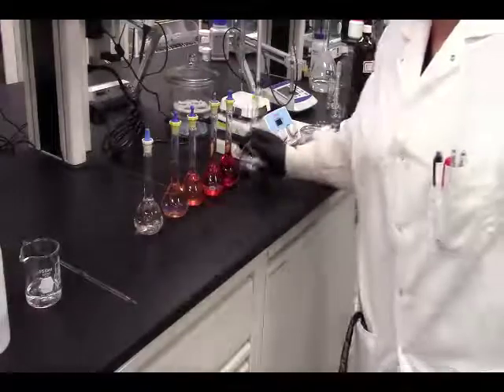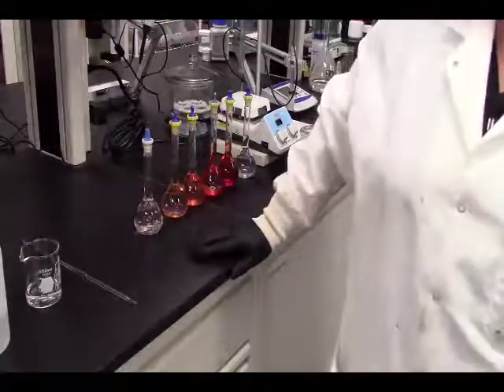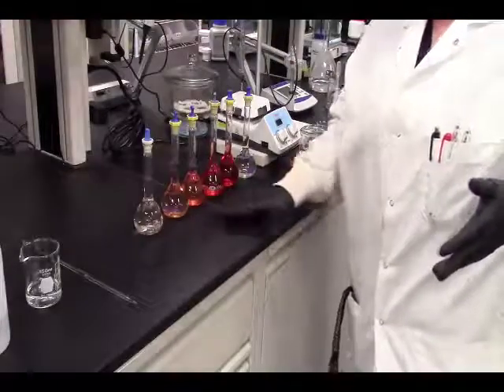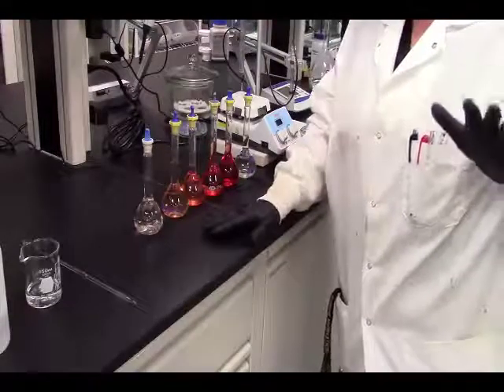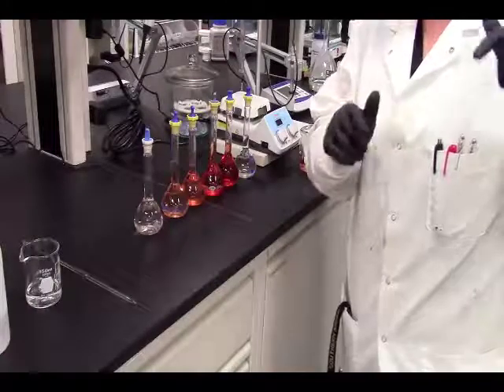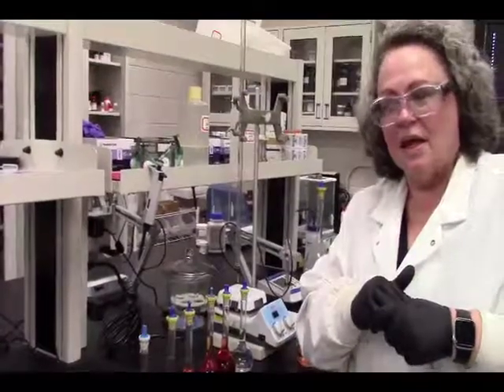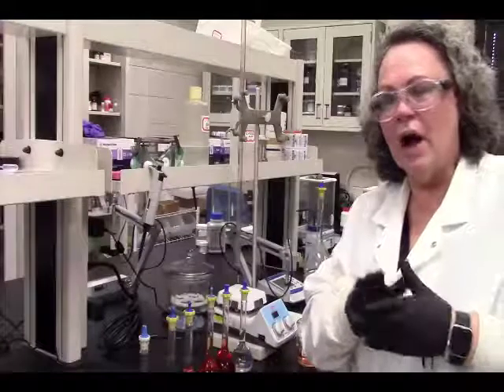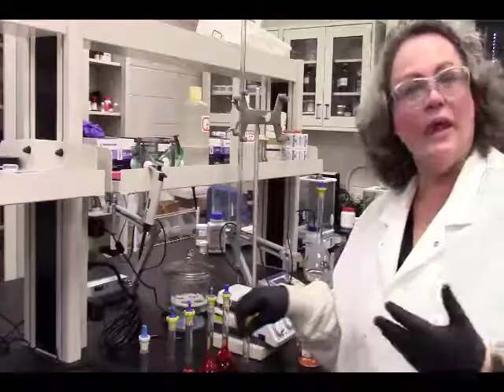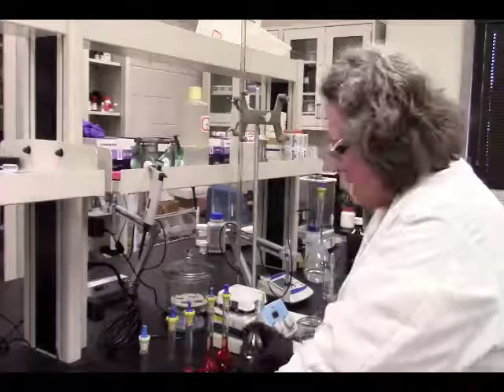Now, for our discussion conclusions, since you're not actually performing the lab and doing the techniques to get the data, you will get the data still, but I want the first part of your discussion conclusion to focus on the method and the technique and why we do what. So it should explain, why do we have to make our blank with everything in it that we put in our samples as the solution?